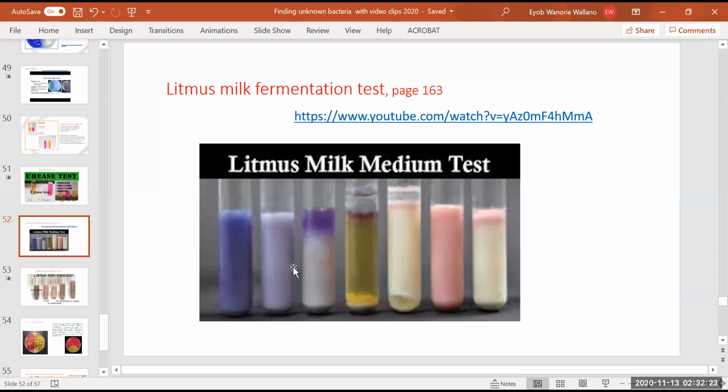You see here, you are going to find the milk as it is, the natural milk, and then this is milk alkaline, bluish, alkaline at the bottom, and then this one has coagulation of proteins inside. Protein is making yogurt.